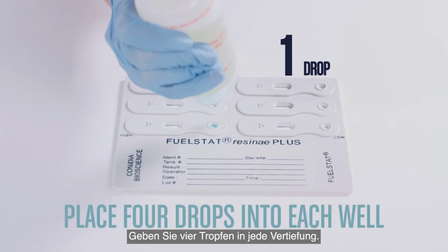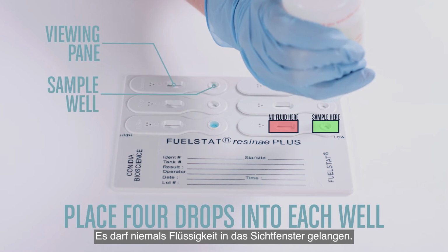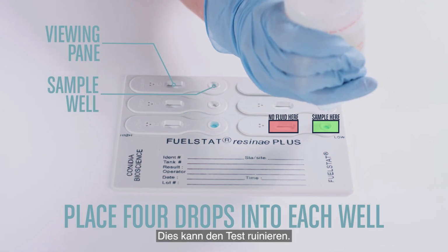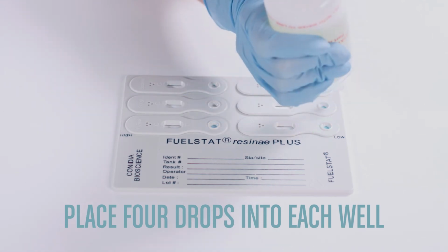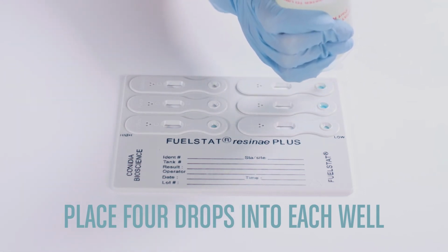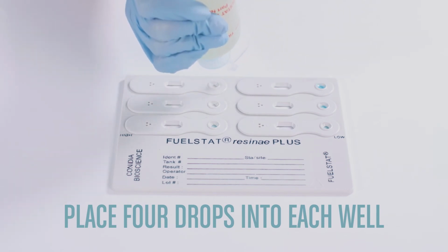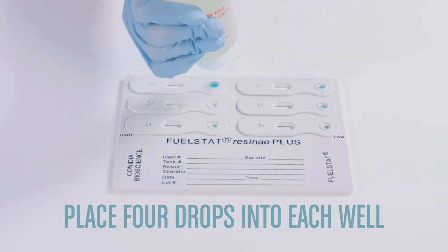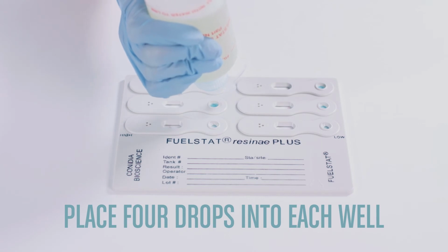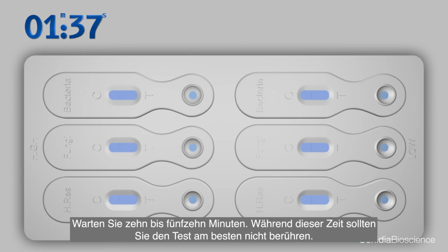Place 4 drops into each well. It is important to never let any fluid enter the viewing panes. This may ruin the test. Wait 10 to 15 minutes. It is best not to touch the test during this time.